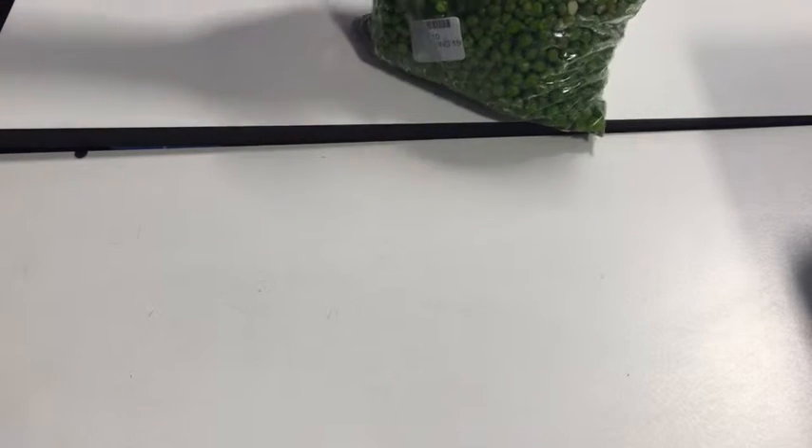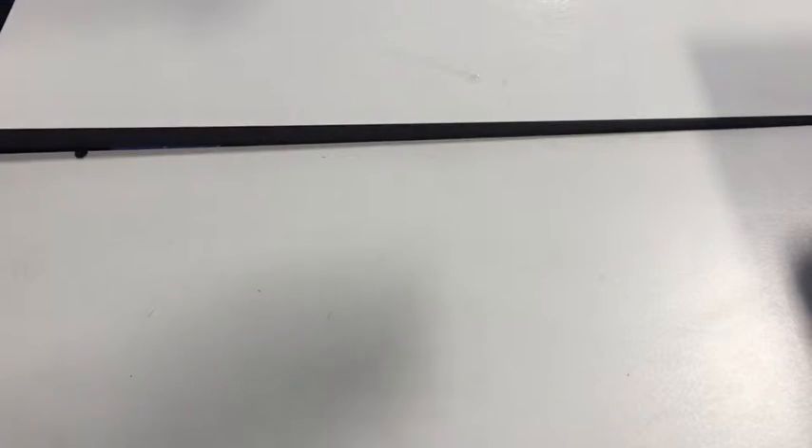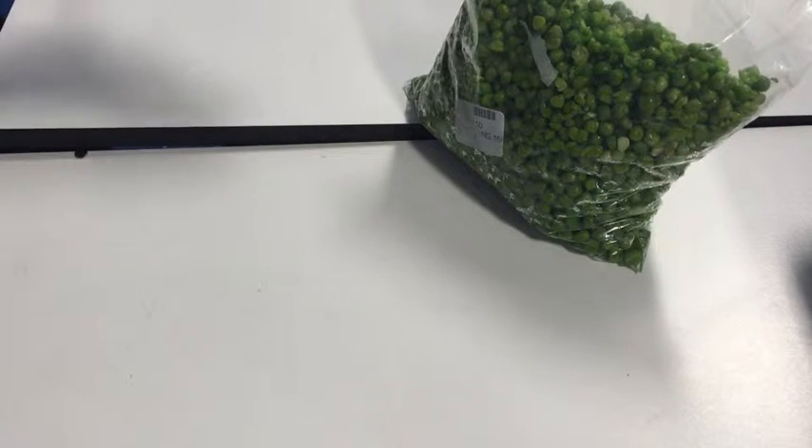Today we're going to extract DNA from peas. You can do this with anything — bananas, as long as nobody in the department has an allergy, onions, kiwi — but today we're using peas. Everything has got DNA: you've got DNA, plants have got DNA.